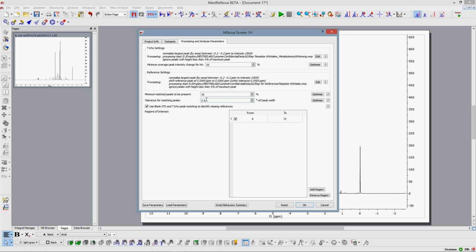We found out that in this case, just a direct peak matching would work for most cases. So we just kept it simple. The only thing that we need to do is become familiarized a little bit with the right values for our screen. Like I showed on my slide before, you can really get a good feeling for this particular value just by stacking all of your data sets, looking at the maximum variations that you would have in there, and getting a bit of a compromise of a value.